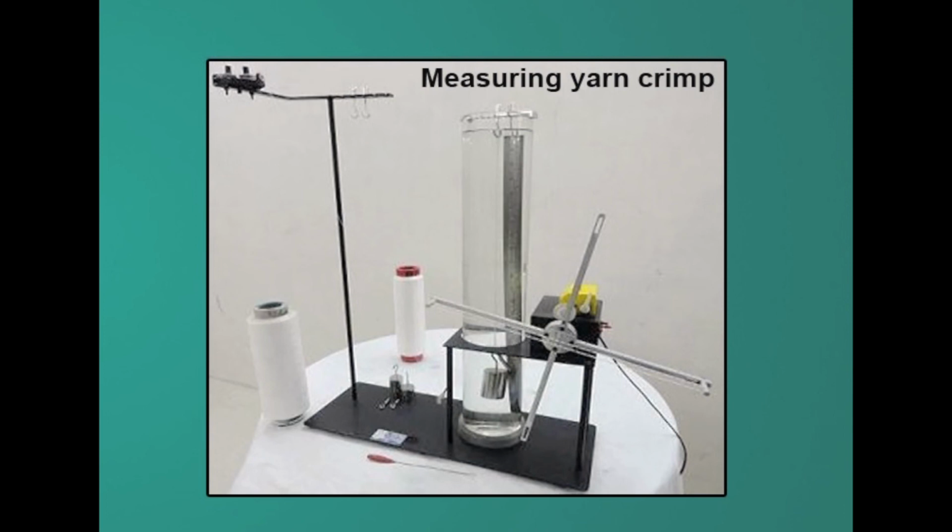The raveling is done in such a way that the central part of the yarn is first ravelled out with a needle very gently, and the end is put into the fixed clamp, and the other end is again gently taken out and put into the movable clamp. Now, after we know the count of the yarn, the standard weight is taken based on the count of the yarn, and that is put onto the weight counter, and now the second gripper, which is a movable gripper, is moved gently from the immovable gripper until the yarn is straight, and we can understand the length based on the scale reading that is already present.